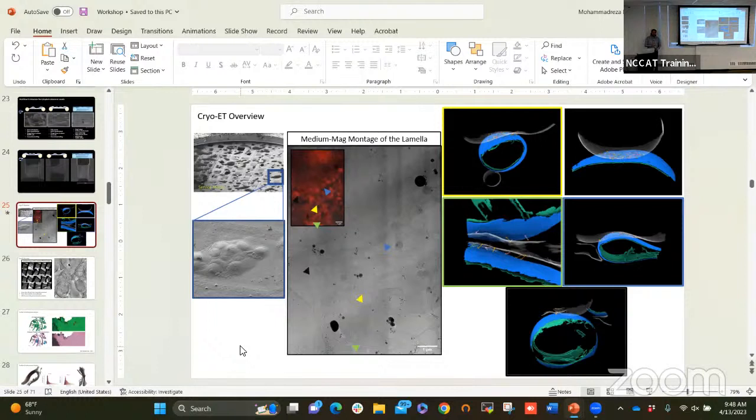And then you can take that to the surface point cloud reconstruction. Yeah, it's a very manual process. So TomoSegMemTV tries to classify your objects based on continuity, but with missing wedge artifacts and just the crazy environment of the cells, you always end up getting random objects that don't make sense. So whatever is close to each other is one object. This is the one that gets microtubule.